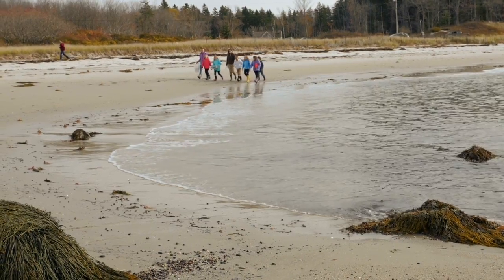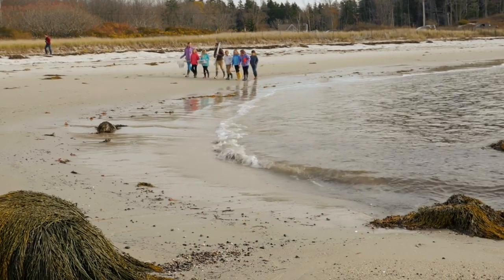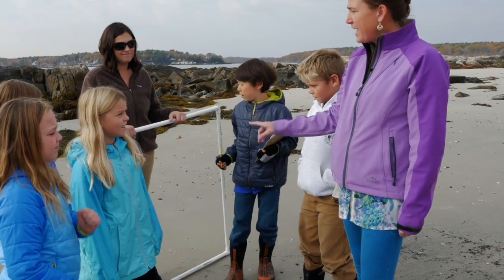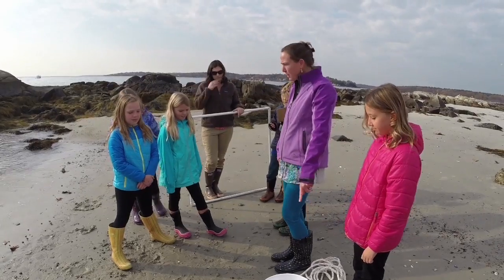So today we were doing a study on the biodiversity and water quality. What we want to find out is if the water quality changes, does the biodiversity of the tide pool change? We're going to do the quadrant with Miss Norton, and we're going to see how many species of different creatures we can find, and we're going to test the water.